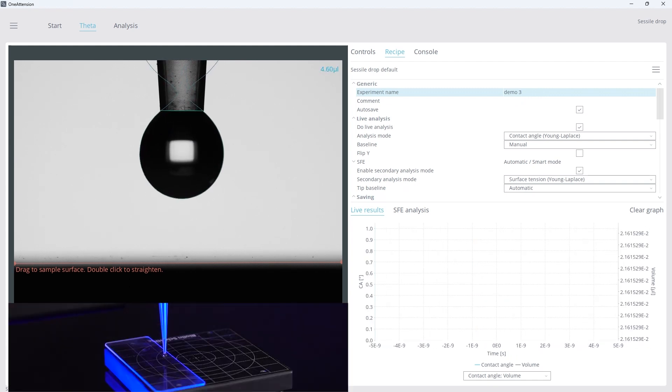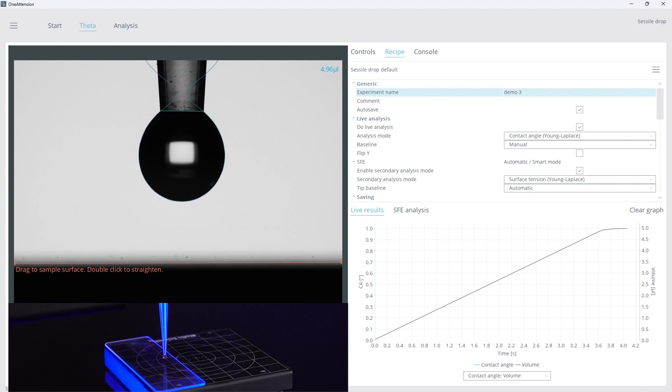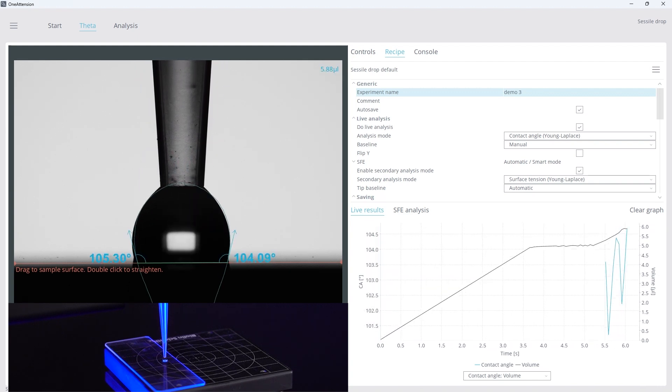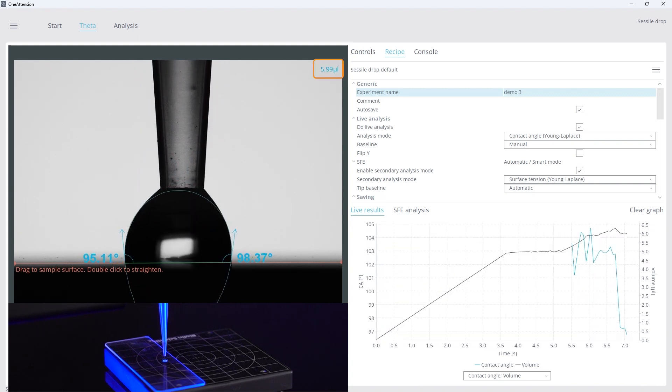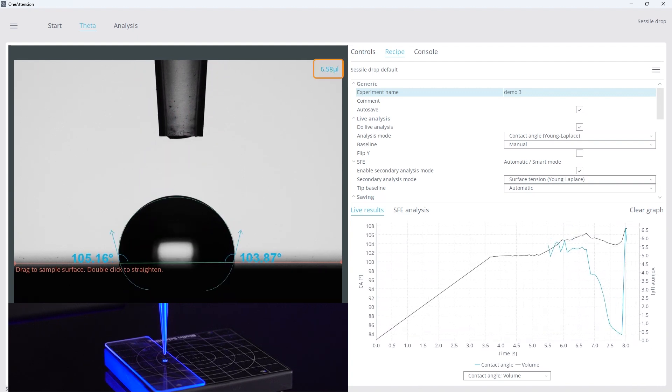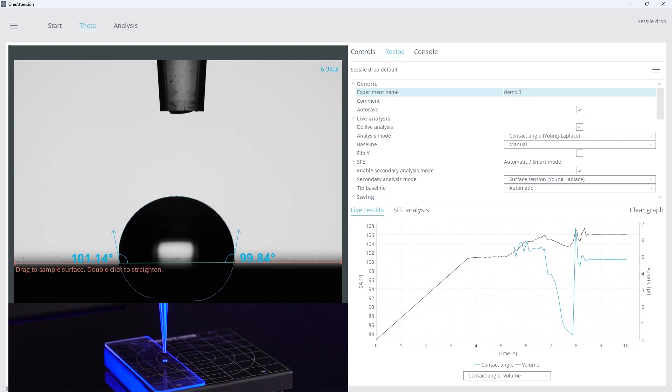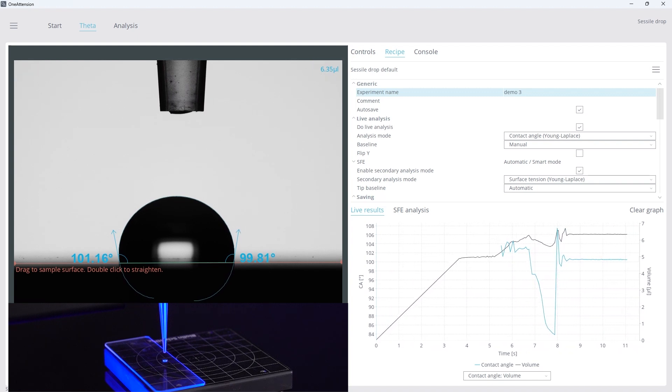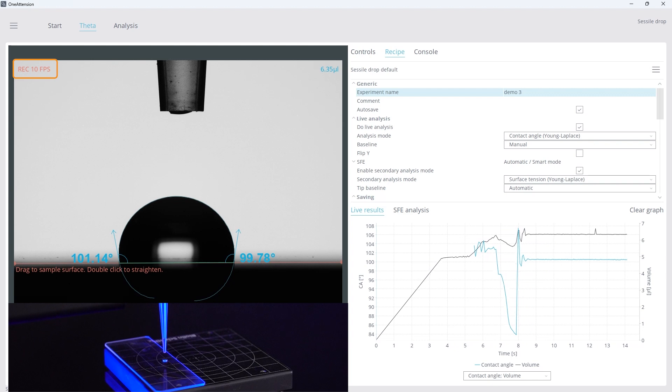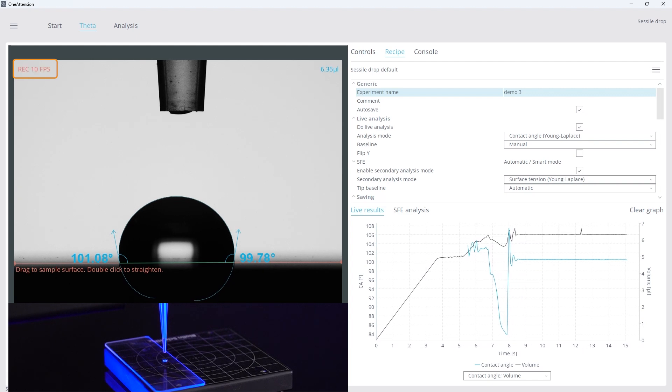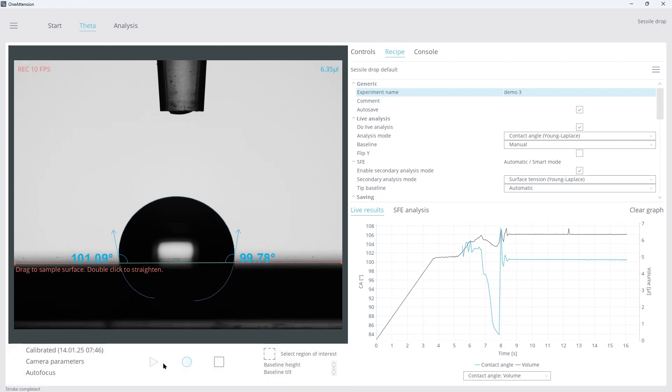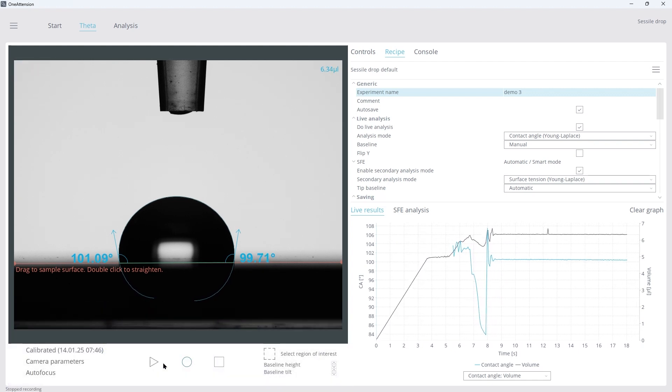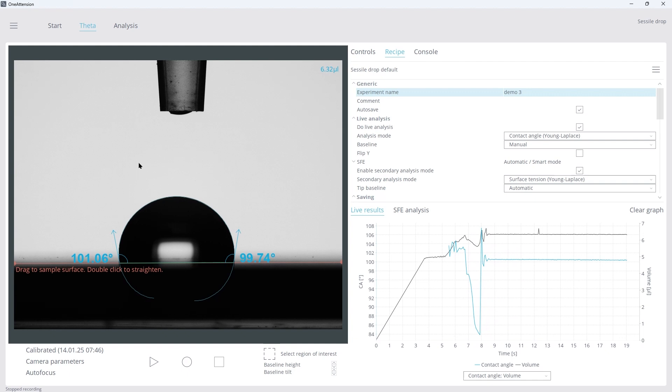The blue outline automatically fits the droplet's shape and the volume is tracked on the top right corner of the camera display window. The contact angle value updates in real time, while the top left corner displays the frames per second, showing that the instrument captures 10 images per second.